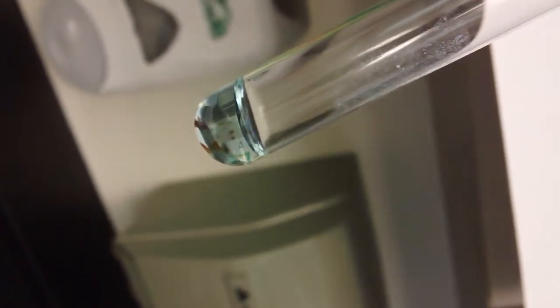Note the little itty bitty solid there at the bottom. It's FE. Also note colors, amounts. Okay, now I have ZN. Kind of like a cloudy clear there. I know it's hard to see.